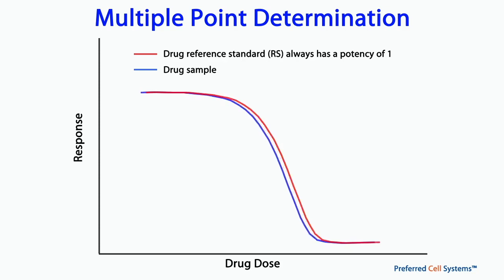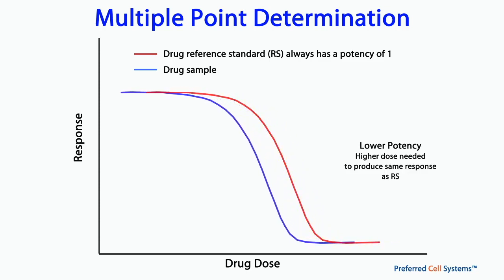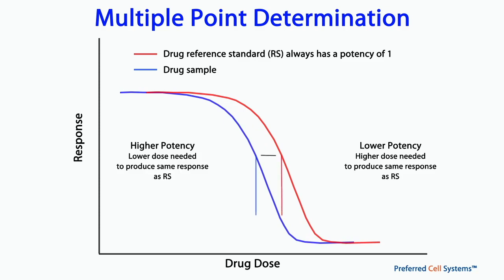It is important that the sample dose response is parallel to that of the reference standard because it indicates that the sample has the same purity as the reference standard. If the sample dose response is to the right of the reference standard, the sample has a lower potency. If the dose response is to the left of the reference standard, the sample has a higher potency. The horizontal displacement between the sample and the reference standard dose response curves is the potency ratio, and this is important because it helps determine the dose of the sample.